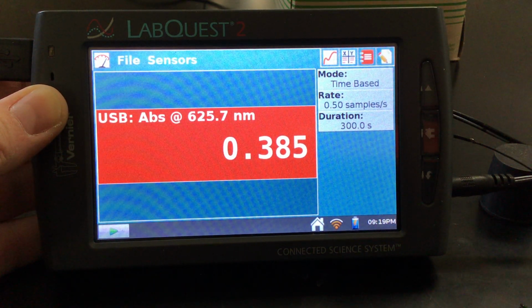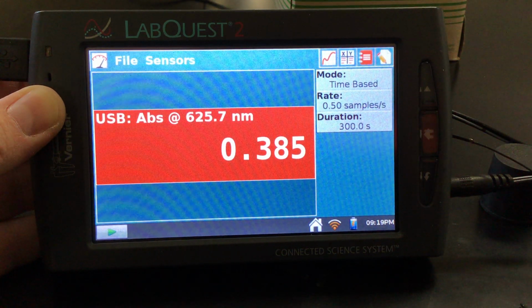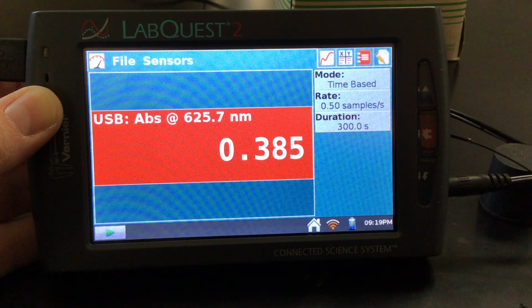What I want to do is go through the analysis of our green food dye and bleach kinetics lab, getting us introduced to the time-based mode on our LabQuest. So what I've already done, I've got my LabQuest hooked up to the SpectroVis Plus.